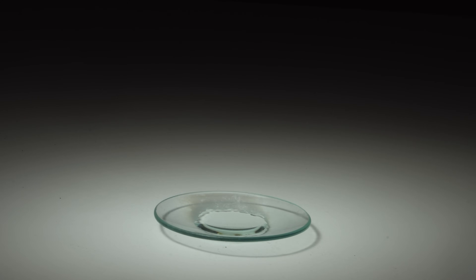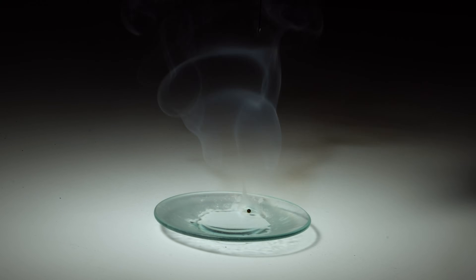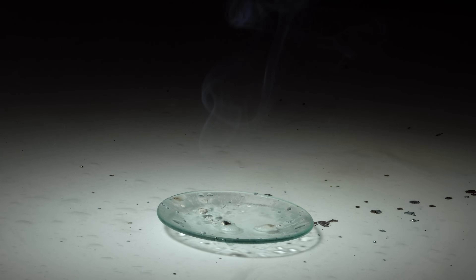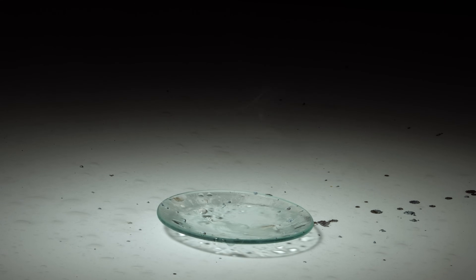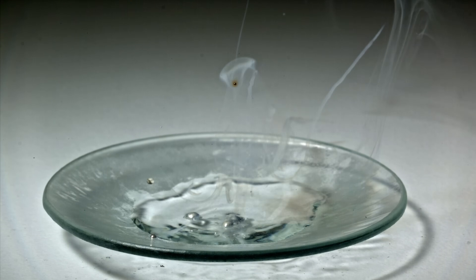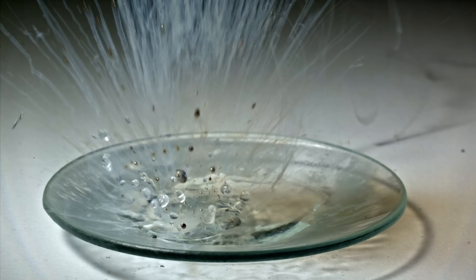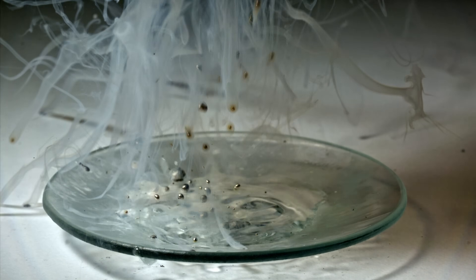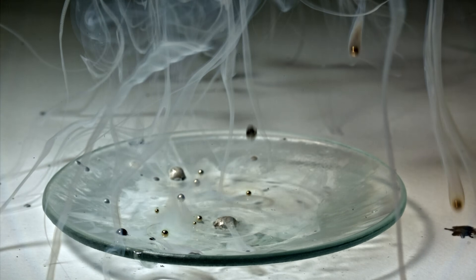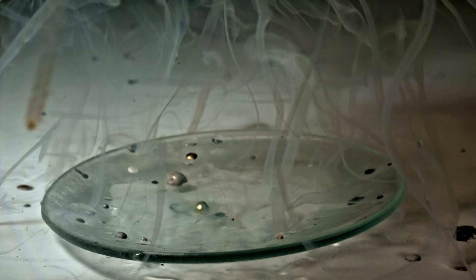I decided to finish this video by reacting with anhydrous hydrazine. If you look closely, you can observe a blue color of solvated electrons, as happens when alkali metals are dissolved in liquid ammonia.